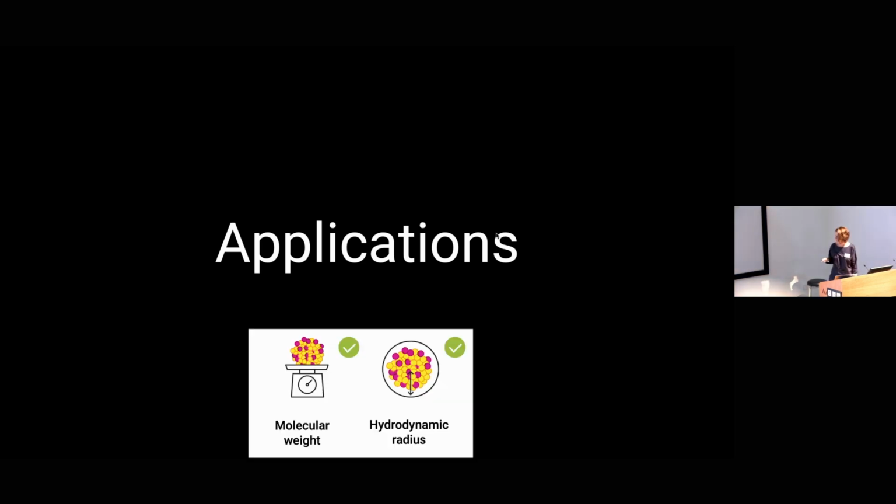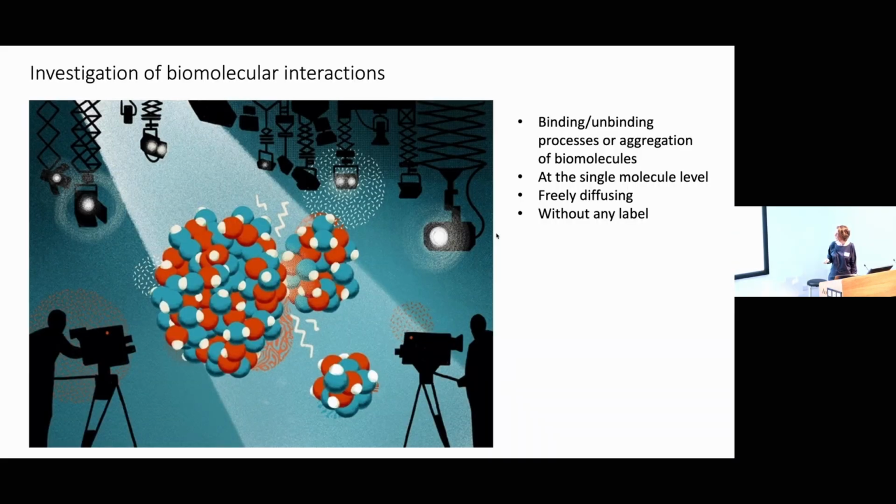So regarding applications, I have already mentioned the size and mass spectroscopy, but I believe there is potential for many more. Right now, we are focusing on applying this method to investigation of biomolecular interaction.